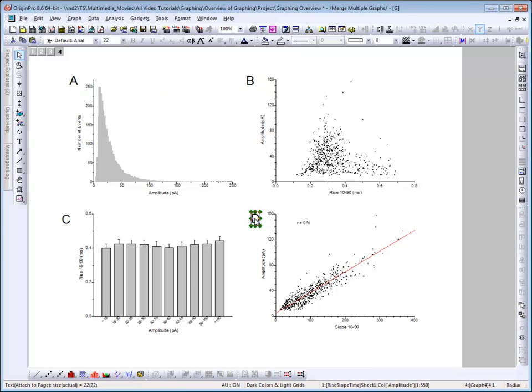We can go ahead and do the same thing. And then we're going to start with this one. Let's see, we'll start. And we want to left align. And do the same thing over here.